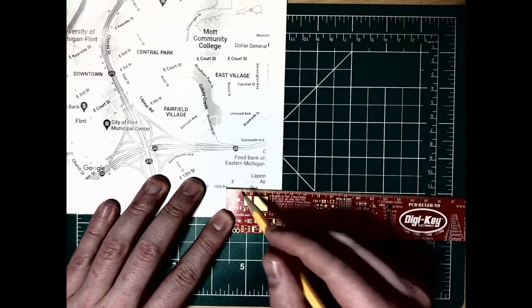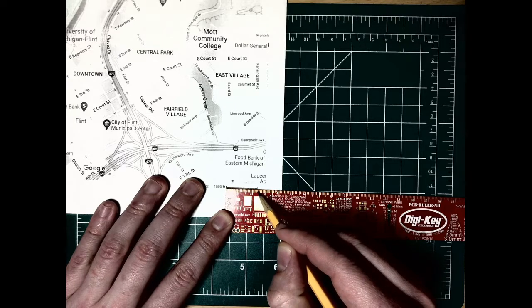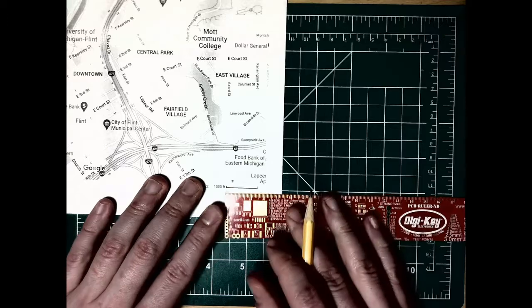So that's going to be 10, 20, not quite 25. I'll say that that's going to be 24 millimeters right there.